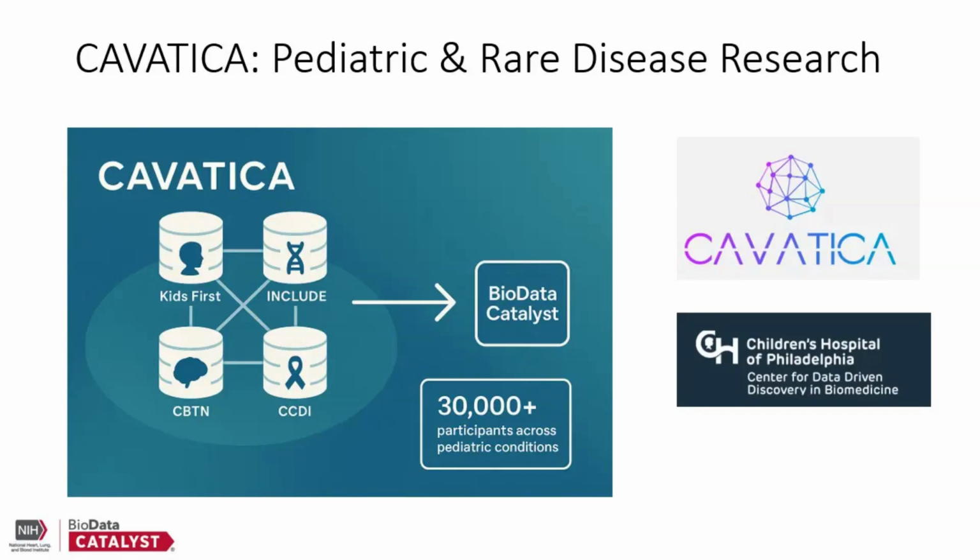When you connect Biodata Catalyst to Cavatica through the External Connections panel, you gain direct access to all of these specialized pediatric and rare disease datasets without downloading and re-uploading files. This integration is particularly valuable for researchers studying developmental disorders, childhood cancers, congenital anomalies, or rare diseases.